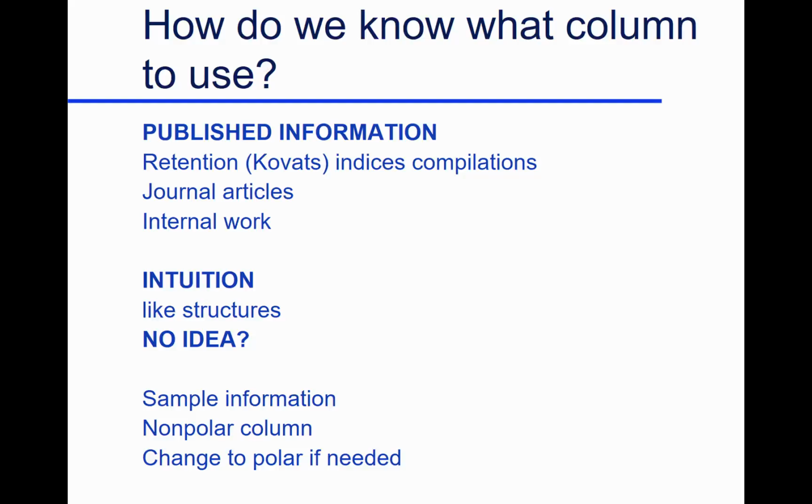So you start off with a very nonpolar column. We have our gas chromatograph set up so you can sit and smell at the end of it. At the end of the column, a little bit goes into a detector. The rest of it goes to you sitting there. You're the detector. And when you get that smell, you say, that's it. That's what I'm looking for. And then you go to other techniques. But it's a fun area.